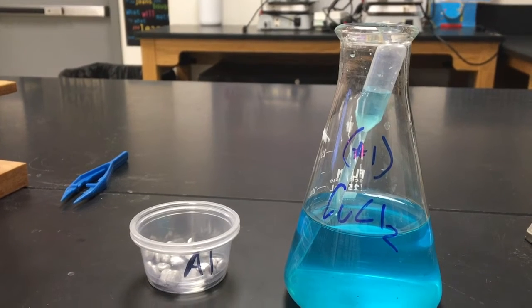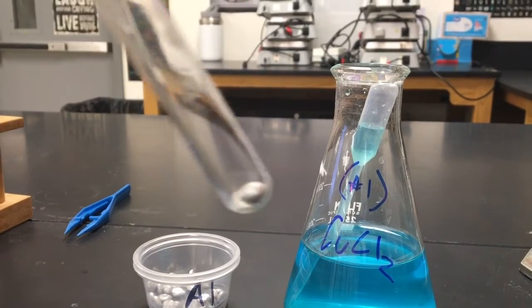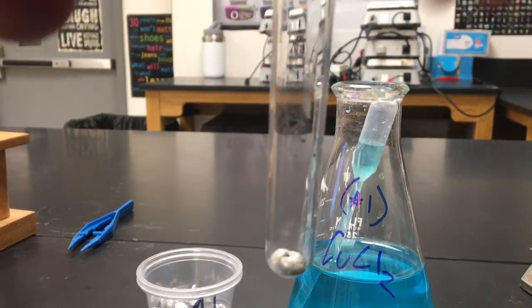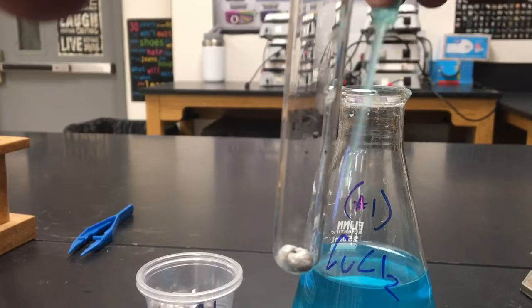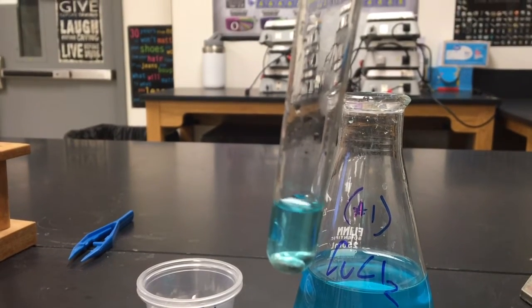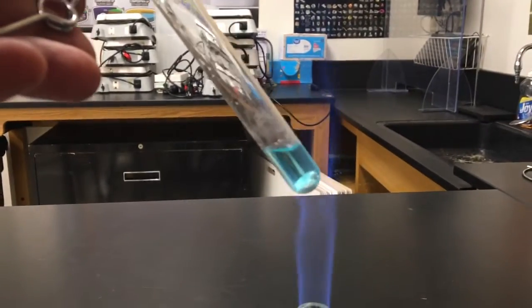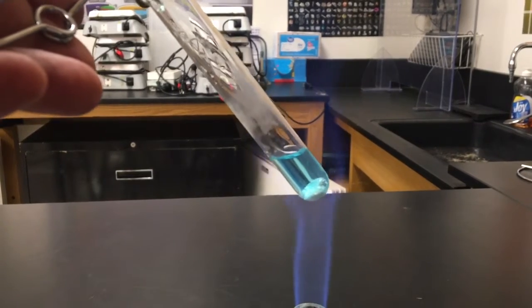Here we've got our reactants for our first reaction, aluminum and copper 2 chloride. And I've gone ahead and I've put a little piece of aluminum in our test tube. I'm going to add some copper chloride to it. And now we're going to bring this over and hold this into the flame just to get this reaction started.